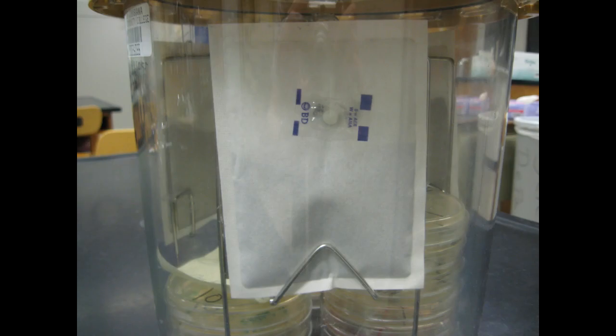That's because that's aerobic right now. This is a picture of when we did set up this experiment, right? And you can clearly see that tablet is colorless, right? There's no blue color to it. So we know by looking at that indicator that this jar at this particular time frame when I took the picture was under anaerobic conditions. Right? There wasn't any oxygen in this jar.